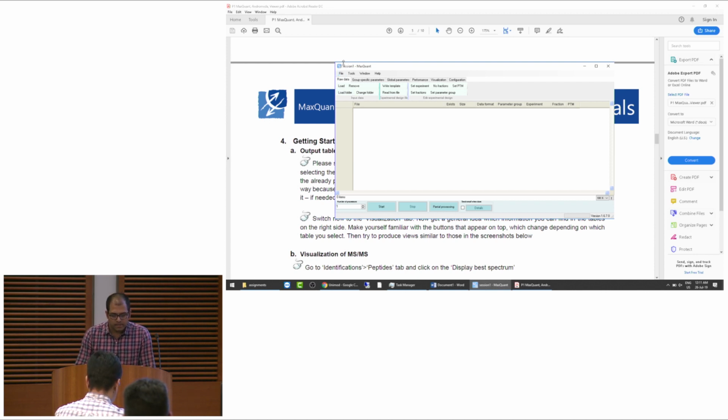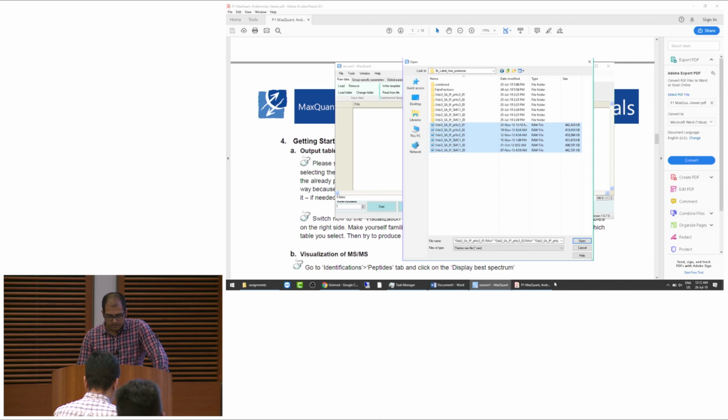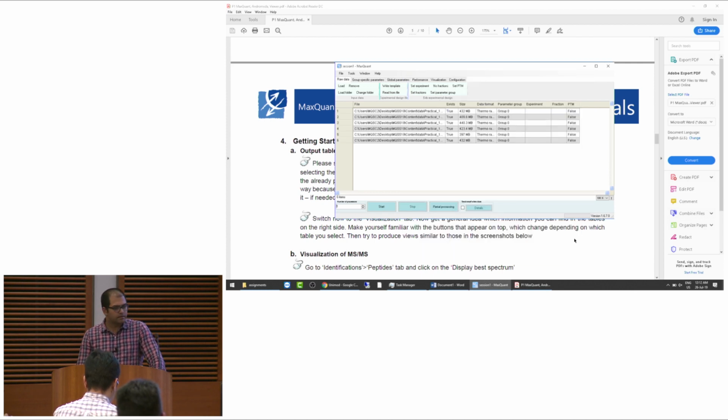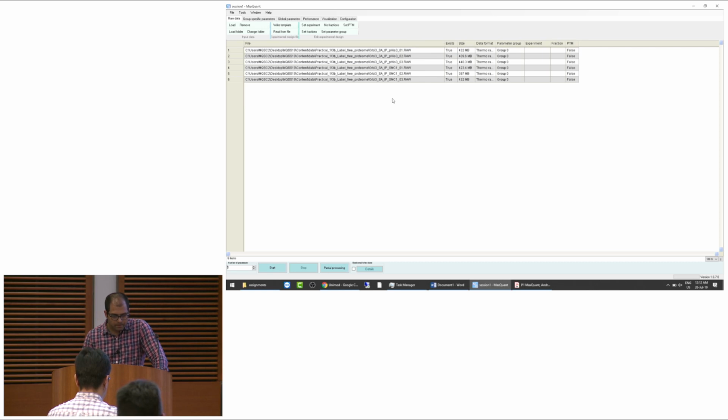Okay, so then let's start with the label-free. So we load the files. So this was this 3B label-free proteome. And we selected the files. In this case, these are 2 pull downs and triplicates. So again, we can just say no fractions. Again, it's taking this common string and then adding this up. Okay, so I think here it's all good.